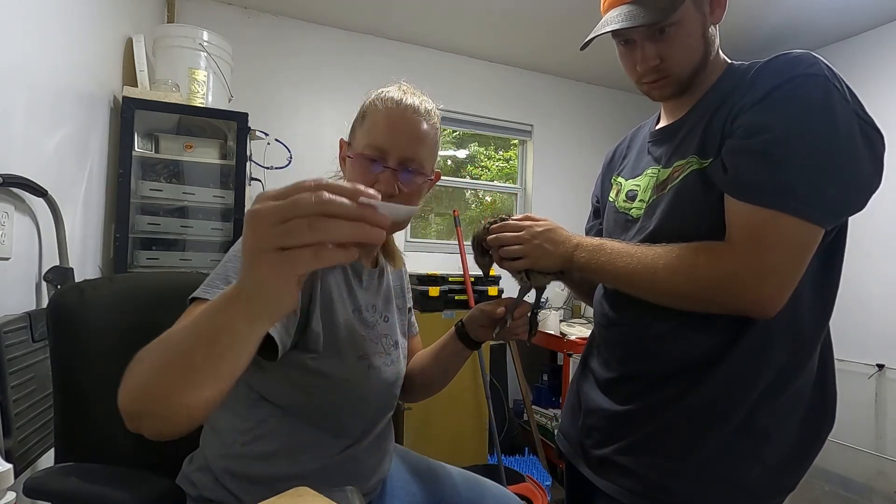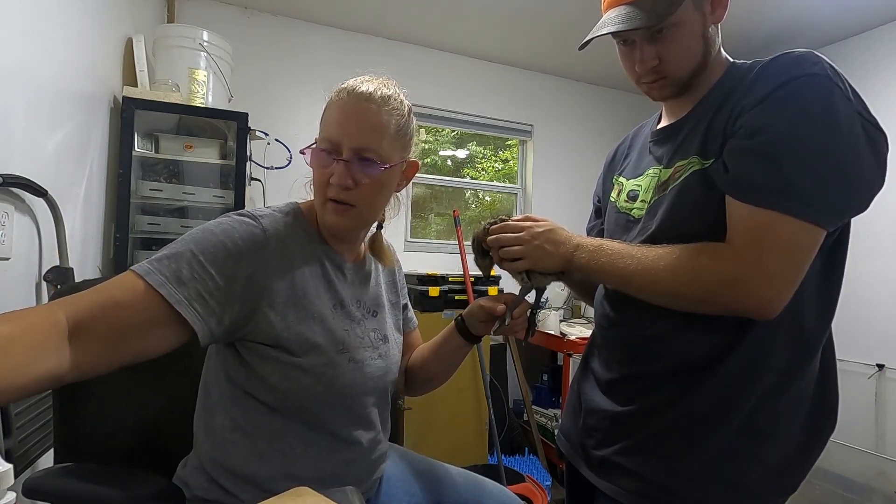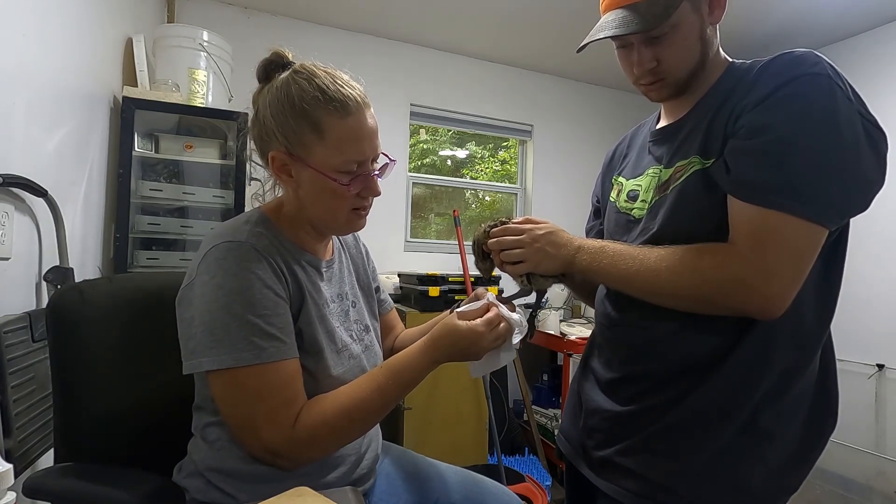So it looks like this. Then I'll let it sit here — you want to go ahead and let it dry. Then I'll take my paper towel and dry his little nail off as much as we can again.